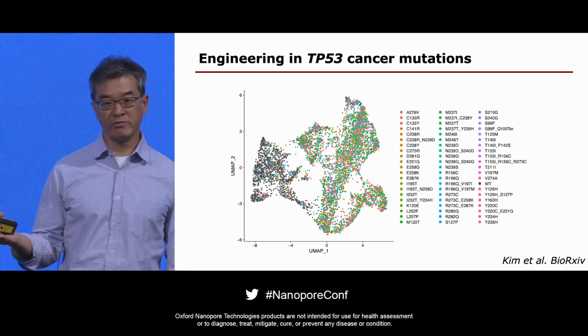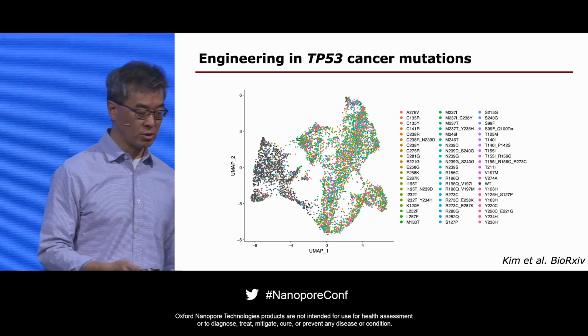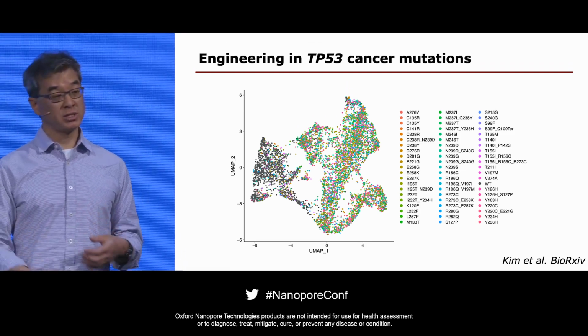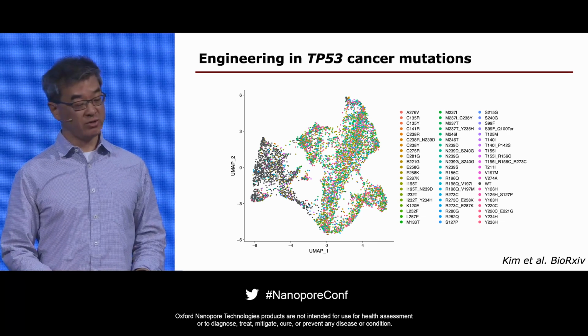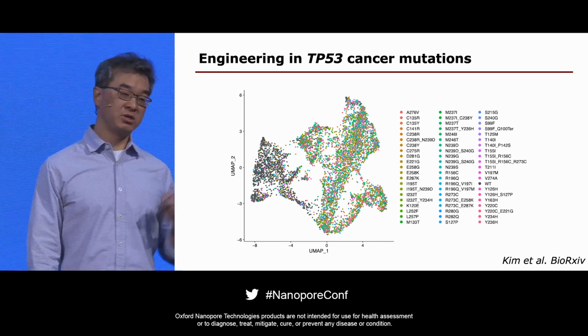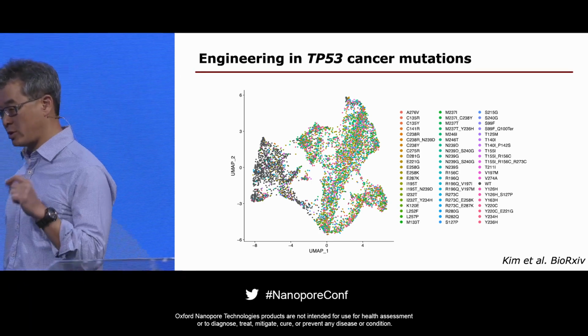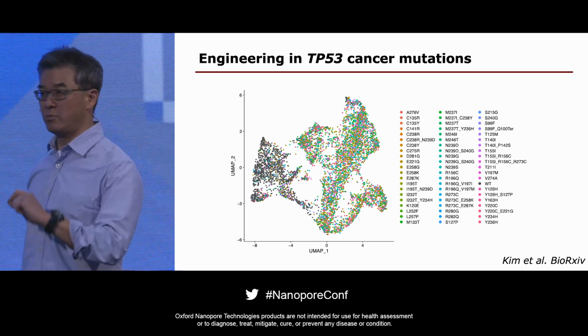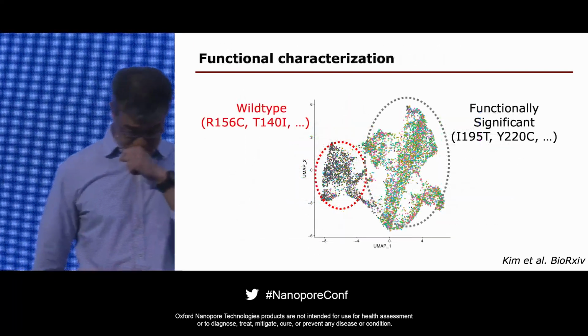But for the vast majority of these p53 mutations from tumors, there's no functional data whatsoever. So we went through this process in a single multiplexed experiment, introduced literally over 100 of these p53 mutations, assigned them to individual cells, and then took advantage of the short-read information to identify what the phenotype was, based on pathway activity and transcriptional features.